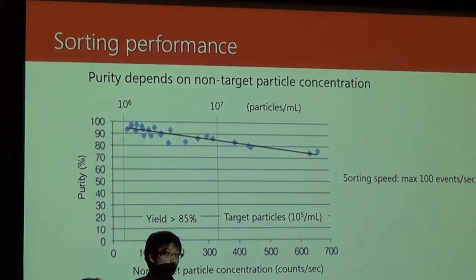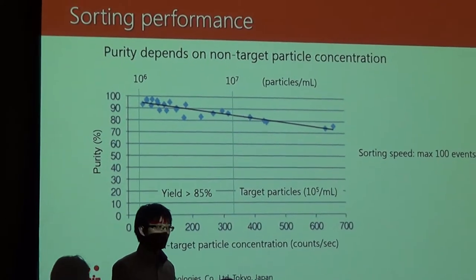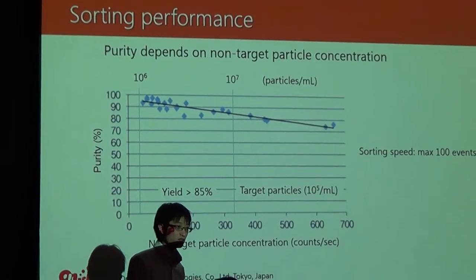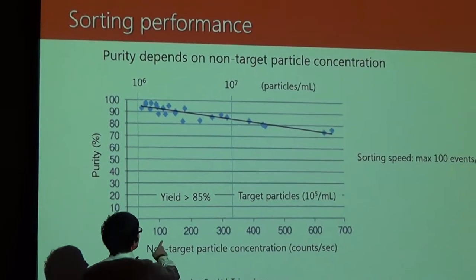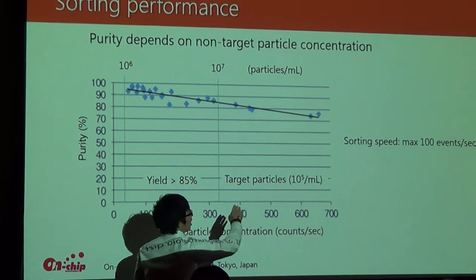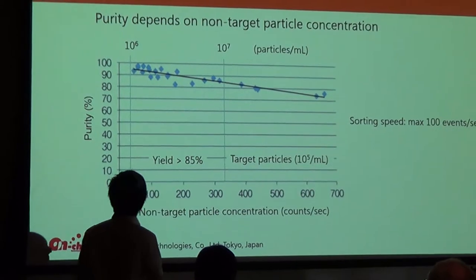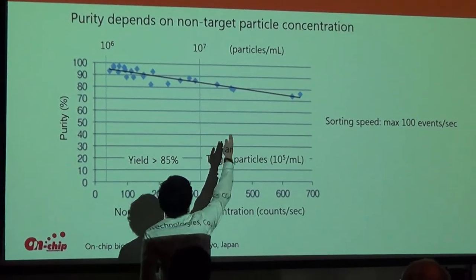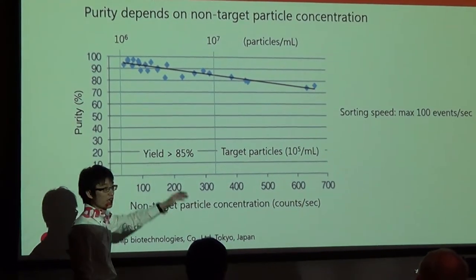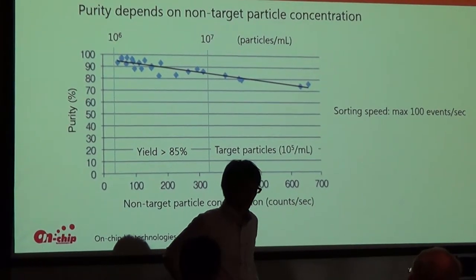Talking about the sorting performance, the performance of the sorting actually depends not on the concentration of the target that you would like to sort out, but more on the non-target. As you increase the number of non-targets, which is on the x-axis, you would have a slight decline in the sorting performance. However, it's still relatively above 80, and of course if you have it at the right concentration, you would definitely have over 90%. And what we call good is 95, and we can achieve that quite often.